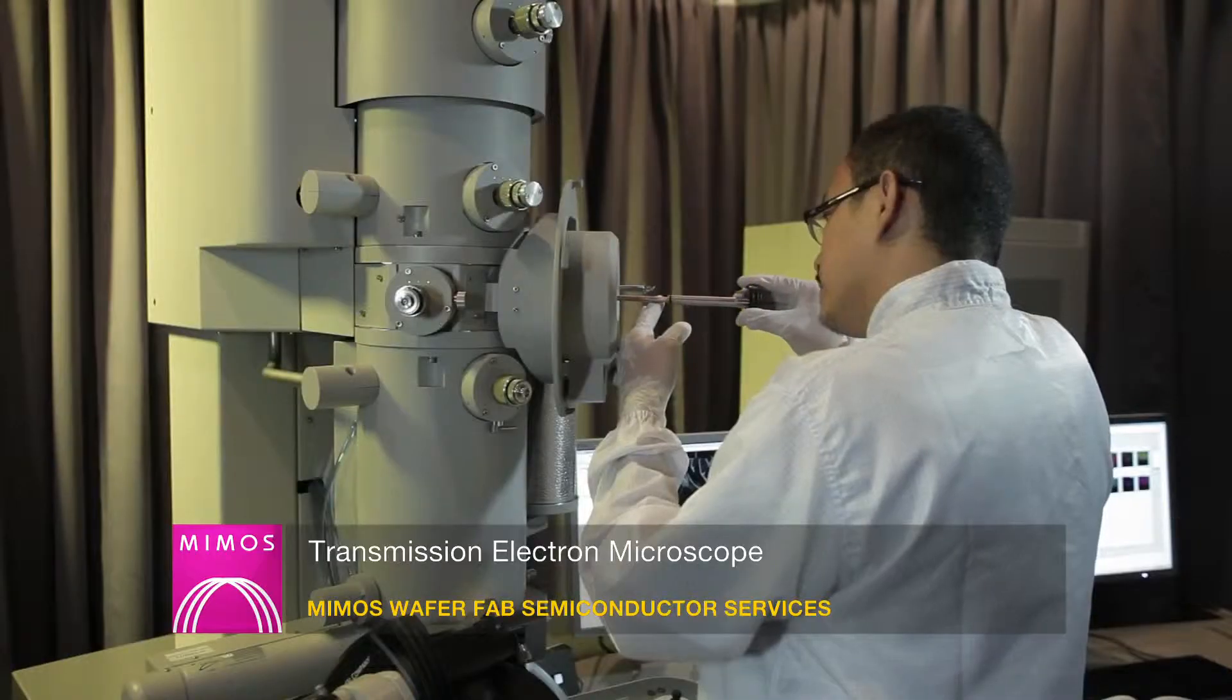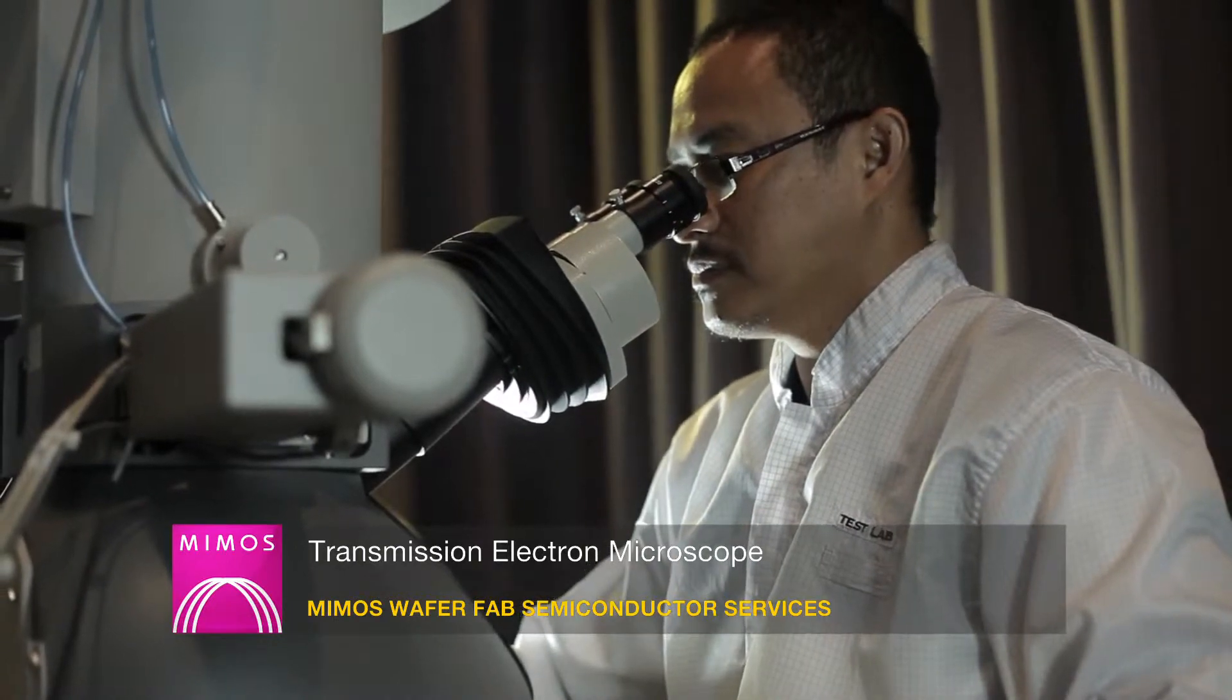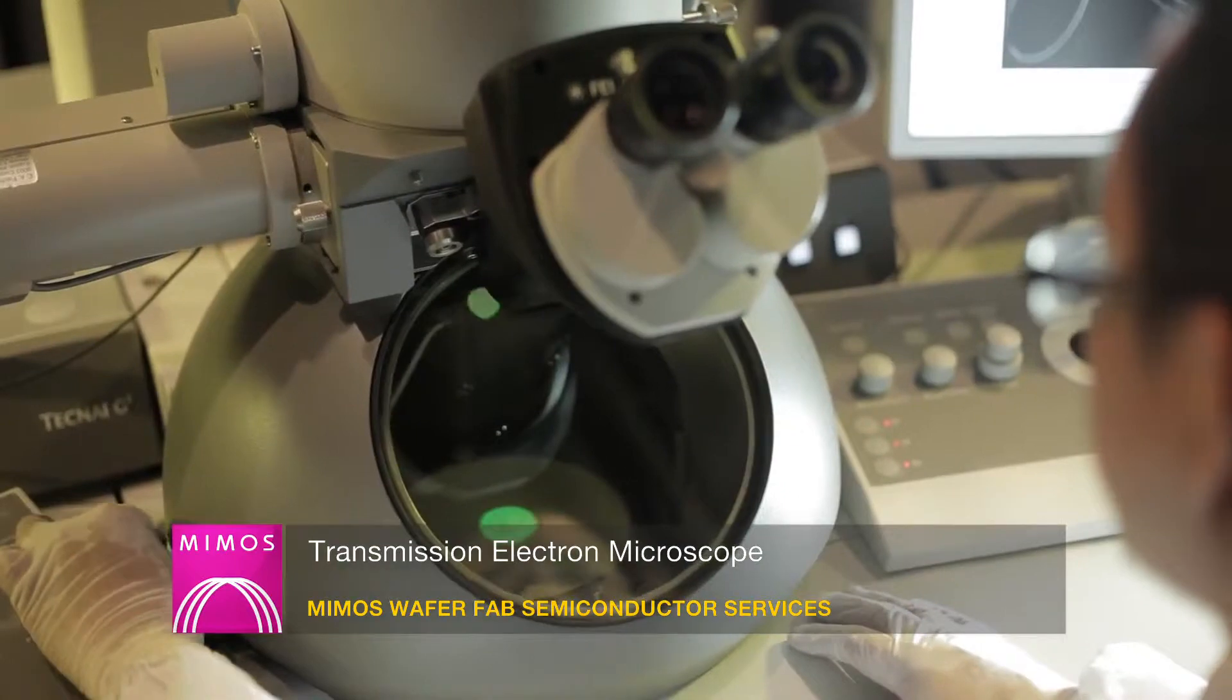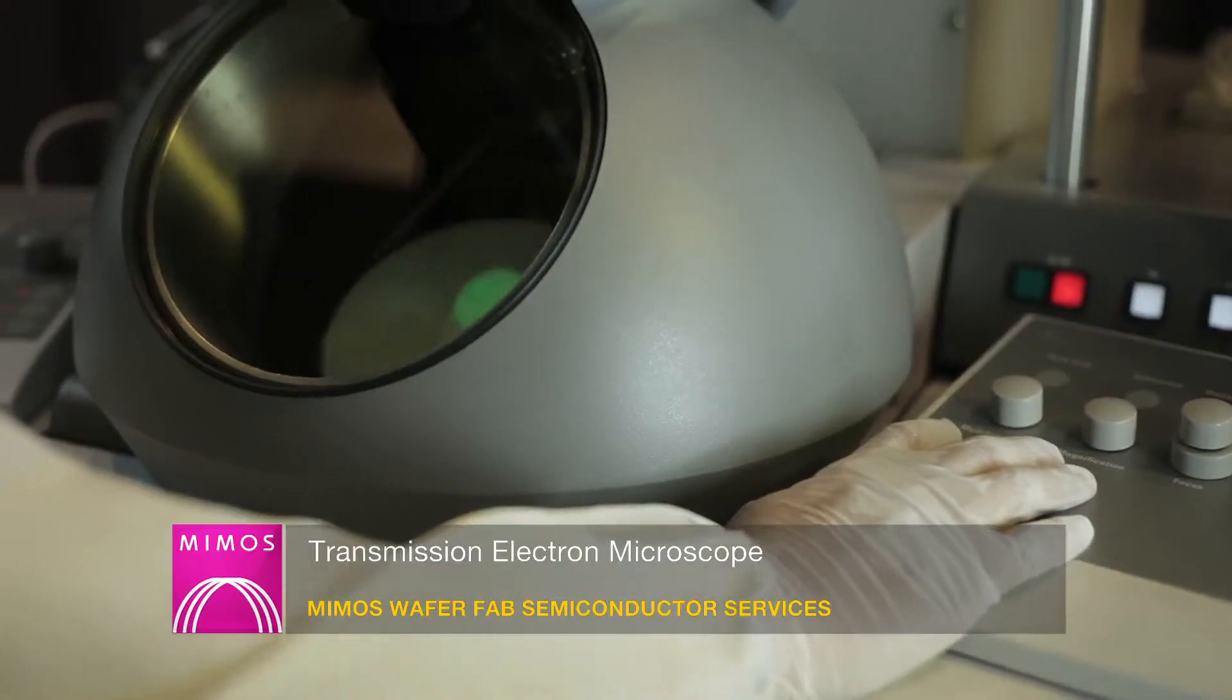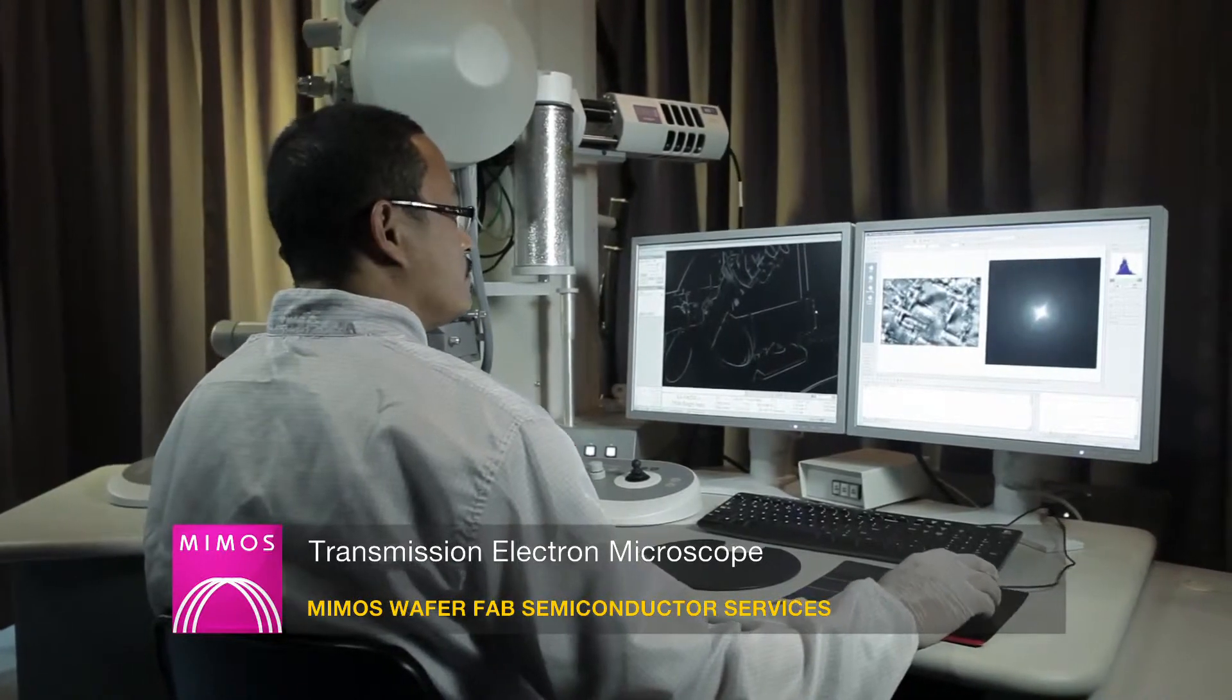Transmission electron microscope is the most powerful microscope that is able to examine fine details within the angstrom level resolution to reveal crystallographic information. The system is equipped with EDS for elemental information.